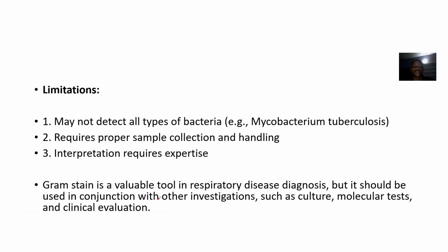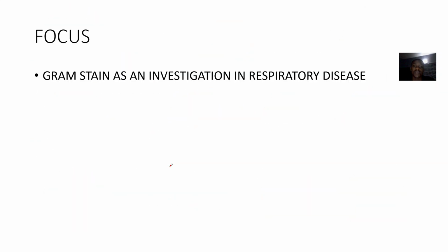Okay, so for limitations, it can't detect all types of bacteria. It requires proper sample collection and handling. Interpretation requires what? You to be an expert to be able to interpret a gram stain test result. Okay, so that's it on using gram stain as an investigation method in diagnosing respiratory system diseases.